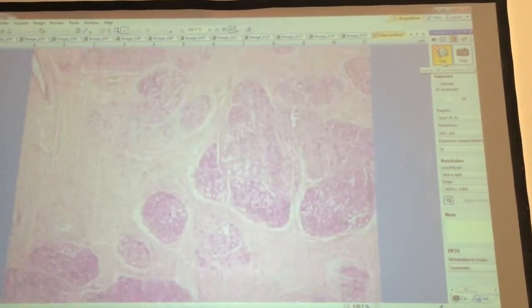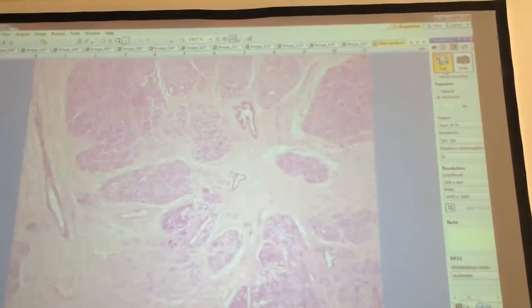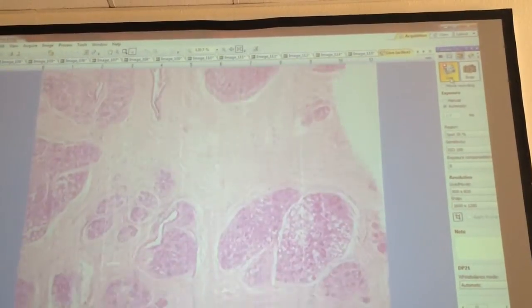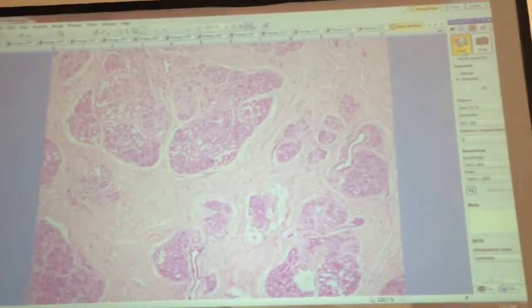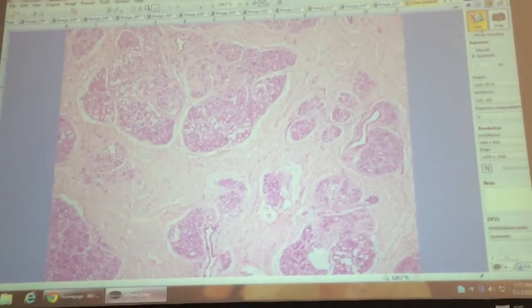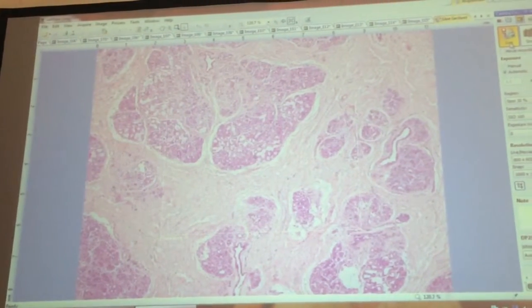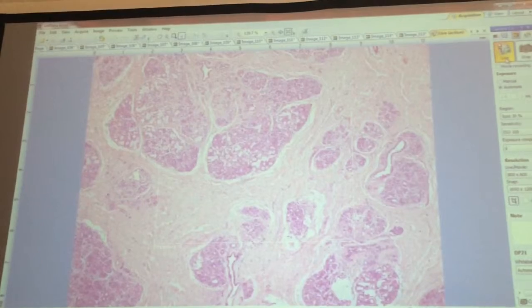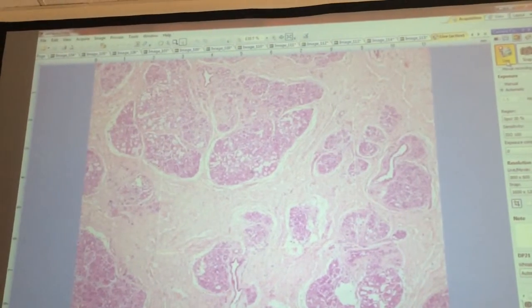Okay. And if I'm looking around for adipose tissue, I'm really not seeing a whole lot of adipose tissue. The point being, most of the adipose tissue that's stored in breast tissue is essentially taken away to make room for all of this glandular structure that has to be put into its place. So there becomes very little amount of adipose tissue in an active mammary gland.